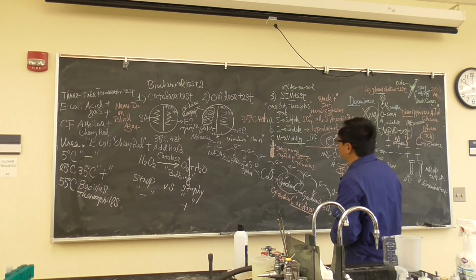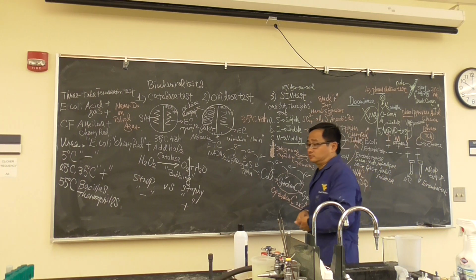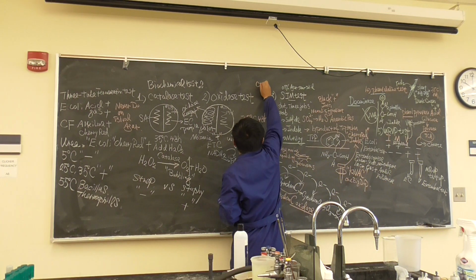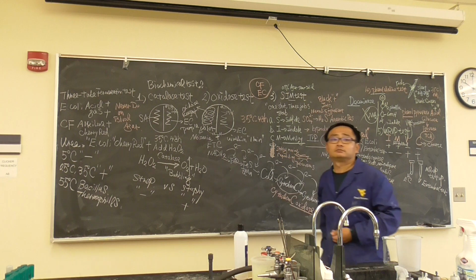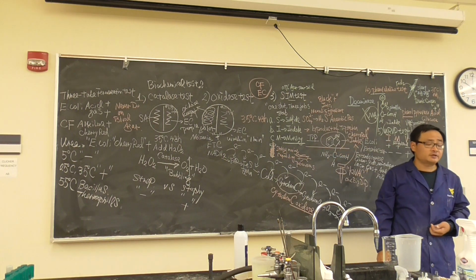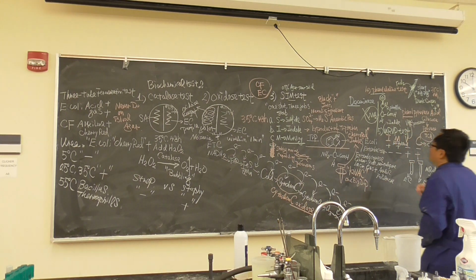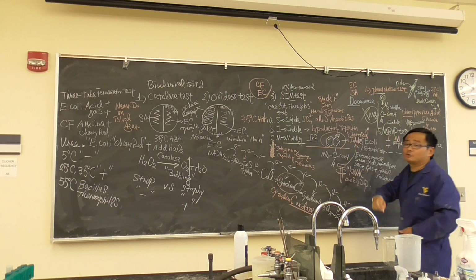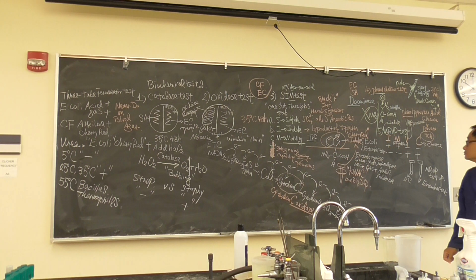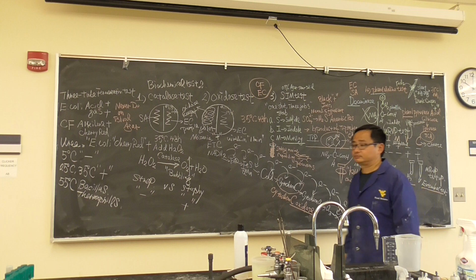Instead of you struggling with the design, for the SIM test, I want you to do Citrobacter, and your bench partner does E. coli. For the phenylalanine test, I want one person to do E. coli, and another person to do Staphylococcus aureus. We'll see whether there's a difference. Is that okay? For MRVP, one person does E. coli, another person does Enterobacter. Okay, is that clear?